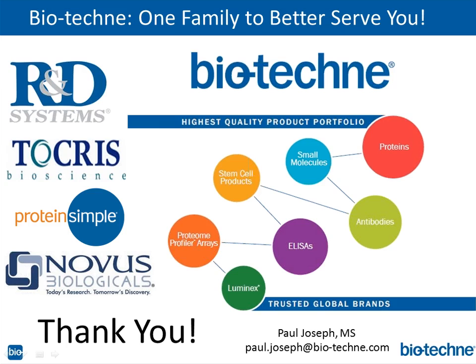I think there are some targets where both will work equally well, but I really think it's based on the kind of target you're looking at, but I don't know which targets prefer which. The signaling experiment, or post-translational modification type of targets, is the one that comes to mind when it involves PBS, but I don't have any other examples.